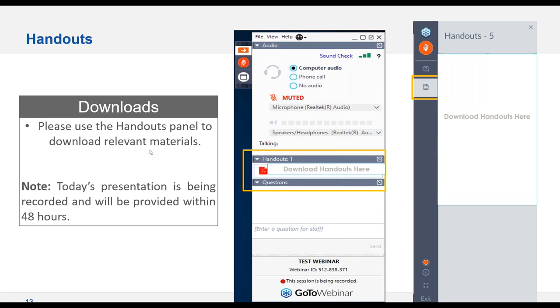Usually with a T, when you're pumping things in, there's going to be a little bit more noise versus spiking. But individual spiking has possible human error, and is more tedious. Yeah, I guess the other comment would be, if you're worried about the internal standard contaminating your samples or adding additional elements that you're looking for, you should check your internal standard for impurities before you use it.